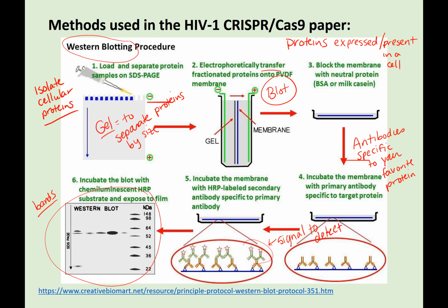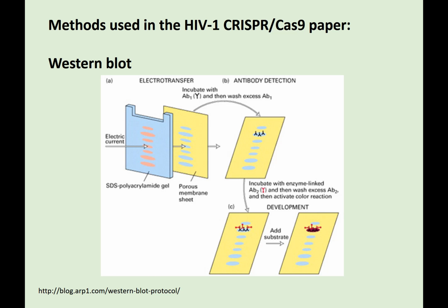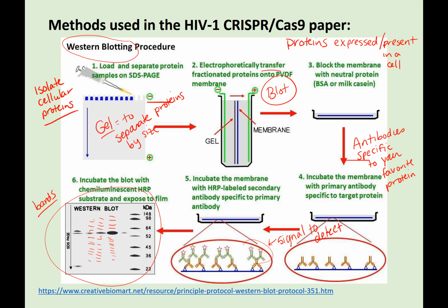The bands that you see, you only see the ones that are specific to the protein that you're looking at, okay? So in reality, there's thousands and thousands of proteins in all of these different sample lanes, okay, and you only see your specific ones due to the antibody detection. So this is a way, again, to see if the protein you're interested in is being expressed, is present in that cell. And so they're going to do that with Cas9, because Cas9 is an enzyme, which is a protein, so they're going to make sure the Cas9 is being expressed in the cells.